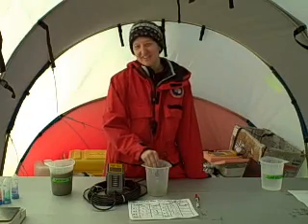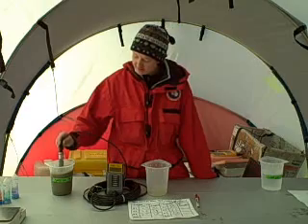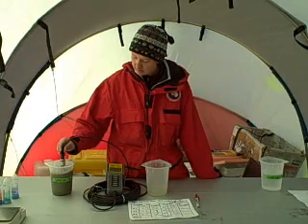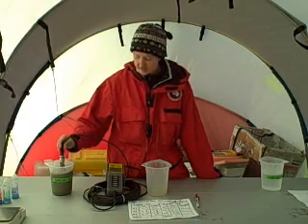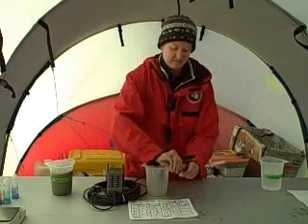For our last set of measurements, we're going to take the conductivity of the dirty ice. So we take our conductivity meter and we're going to gently stick it into the dirty ice sample. And we get a reading of 2,838. It's a big one.